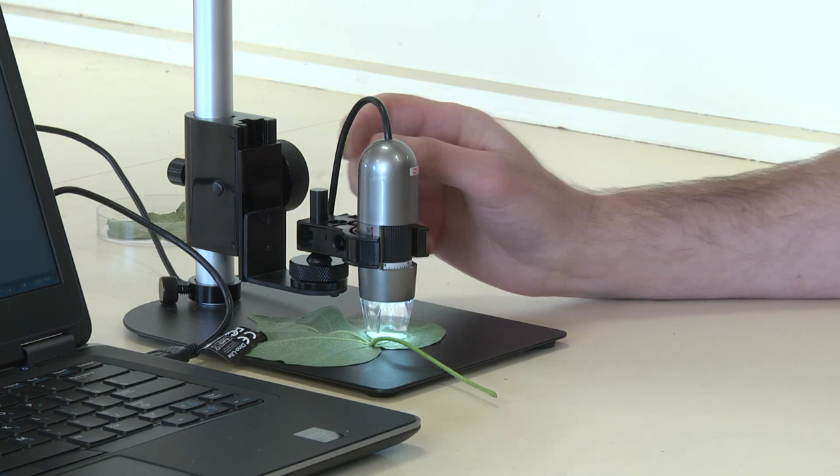We often get asked how to assess silverleaf whitefly parasitism. Today I'll just do a brief run through on how to do that using a digital microscope.